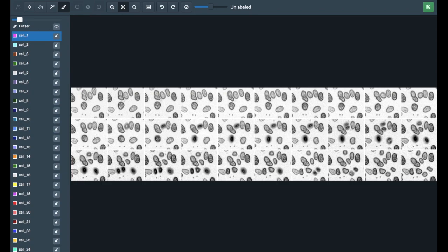In order to label the cells, you will have to color in each cell in the image, keeping colors specific to the cell. So, for example, this cell might be colored red throughout the film, while this cell might be colored green.